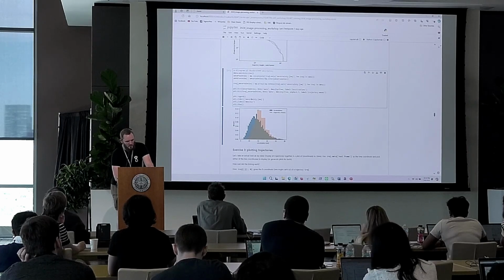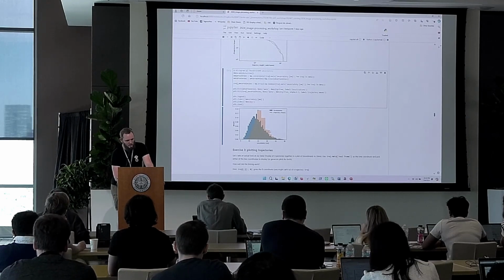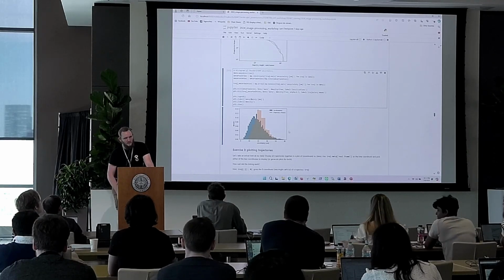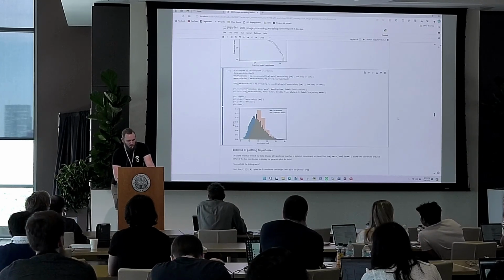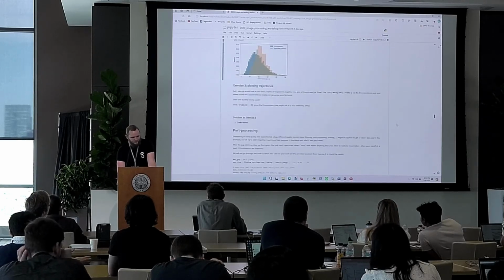We can histogram this, which gives the blue histogram here. In orange is the histogram of means over trajectories. The fact that they have similar spread here hints that the localization accuracy might actually be heterogeneous across trajectories. We would have to run some deeper analysis to get a really reliable statement on that.